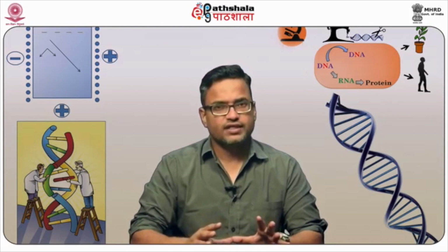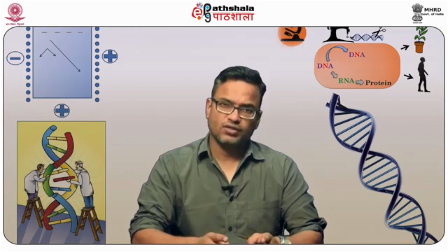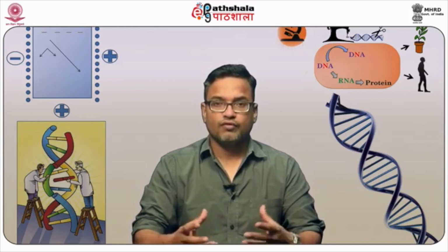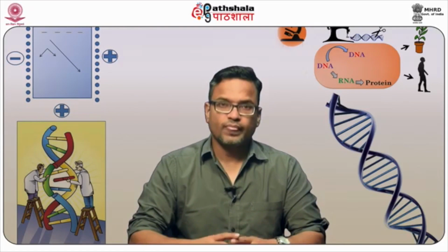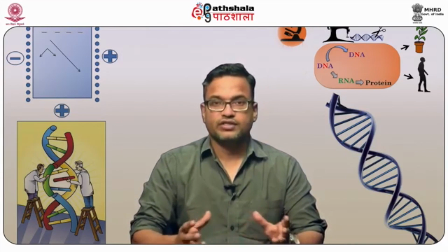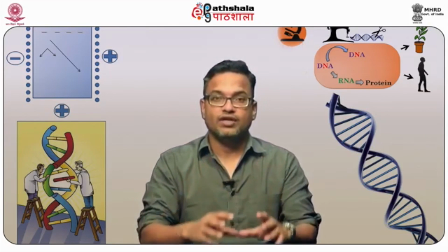Now, how do we magnify it? The magnification takes place by using convex lenses. It could be a single convex lens, or a combination of a couple of convex lenses to enlarge a smaller image. Microscopes utilize light, because you cannot see an object in the dark. You need an object which is well illuminated.